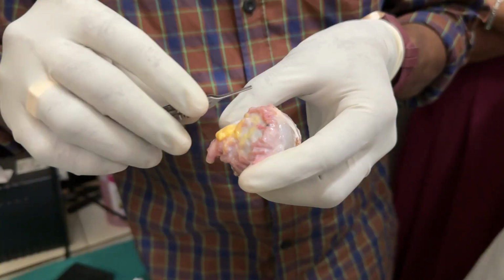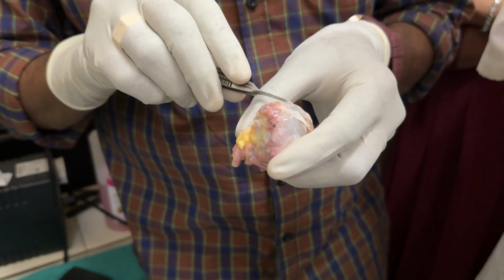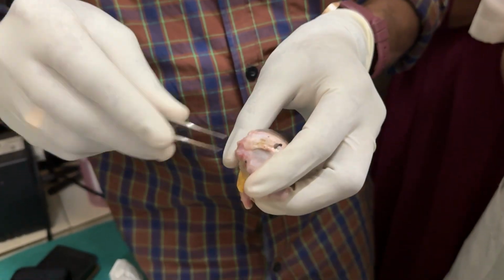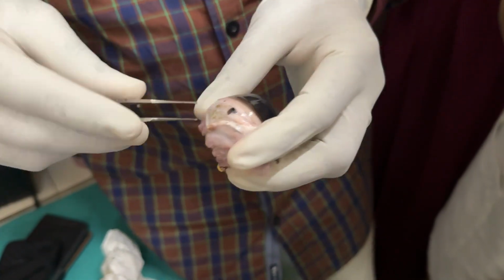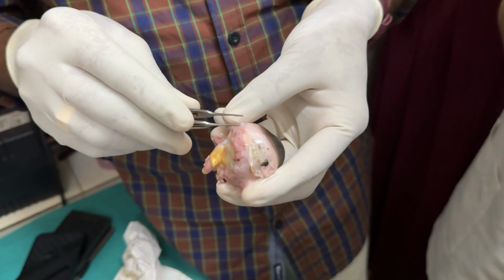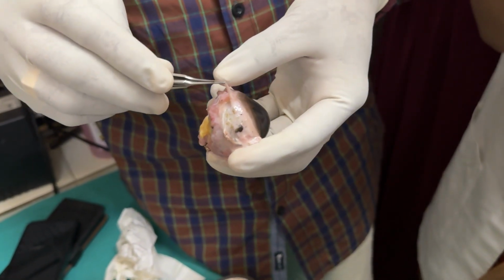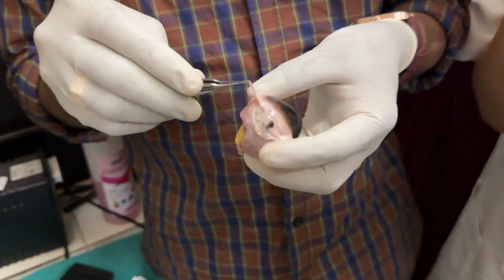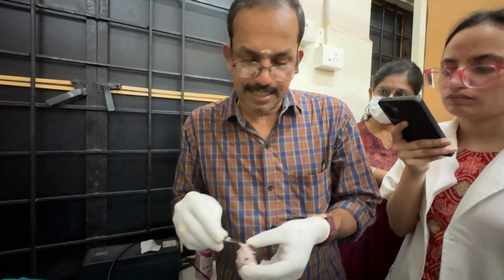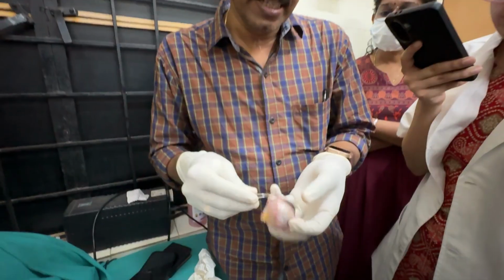A small area of oblique muscle fibers we will also get if you are very keenly observing the membrane. This is the conjunctiva, a freely movable membrane over the sclera. It's a type of mucous membrane. You have heard the term conjunctivitis. We very commonly use it, as the conjunctiva is vascular tissue and may get inflamed frequently. Allergic, traumatic, viral, bacterial conjunctivitis.